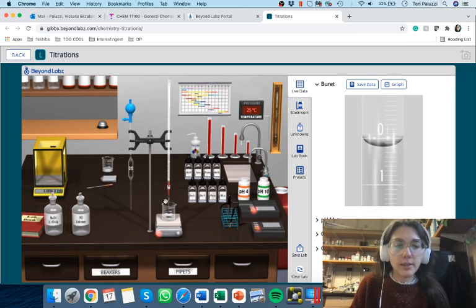So I just pull this close. For your scout, you're going to pull it down, and you really don't care if it turns. Now, if you want to be fancy, you can do a careful one first, and then just do 2 careful ones, and just pretend your scout wasn't that crazy. Me, because I've done this experiment before in real life, I kind of know that around 20 things start getting a little crazy.